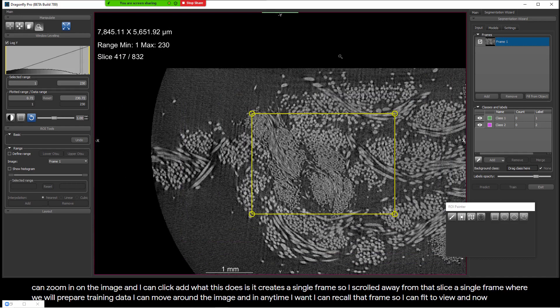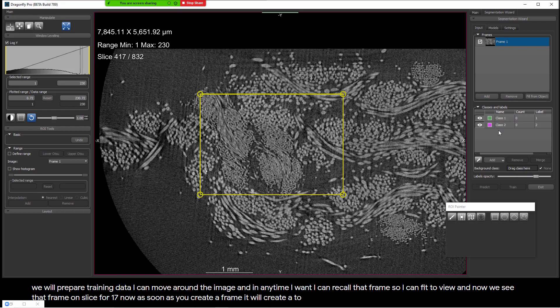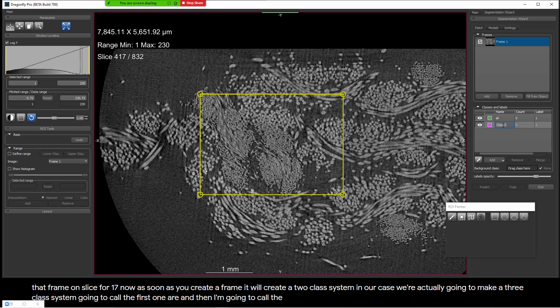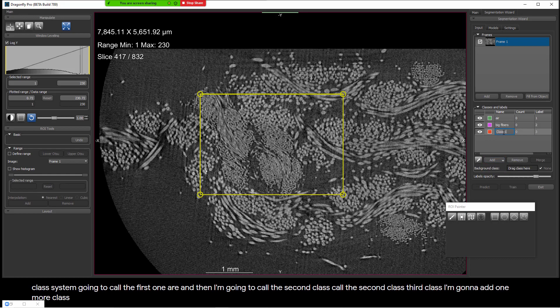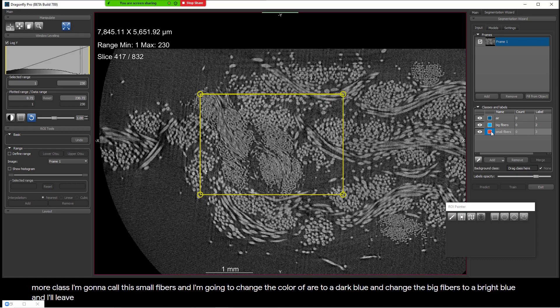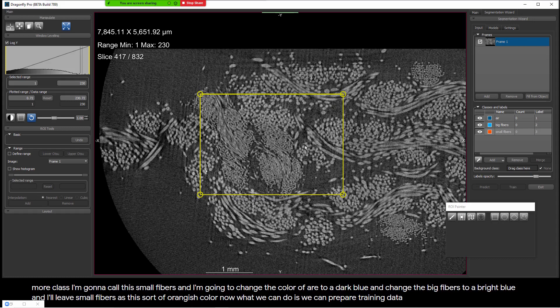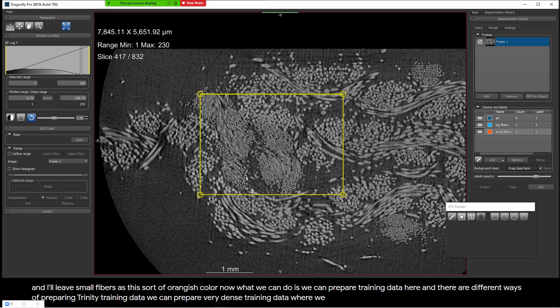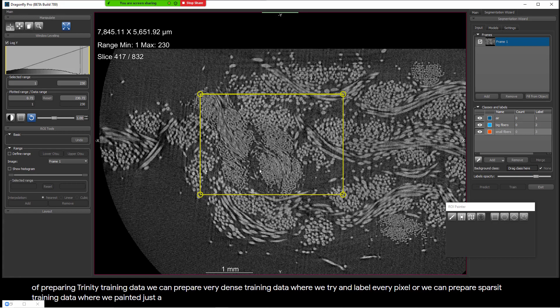I can move around the image and recall that frame at any time — I can fit to view and see that frame on slice 417. As soon as you create a frame, it creates a two-class system. In our case we're going to make a three-class system. I'll call the first one air, the second class big fibers, and I'll add one more class called small fibers. I'm going to change the color of air to dark blue, big fibers to bright blue, and leave small fibers as an orangish color. We can prepare training data here in different ways: dense training data labeling every pixel, or sparse training data painting just a few pixels in the field of view.